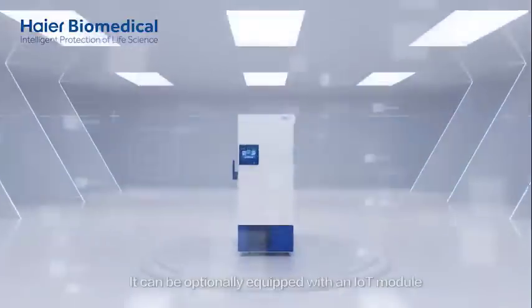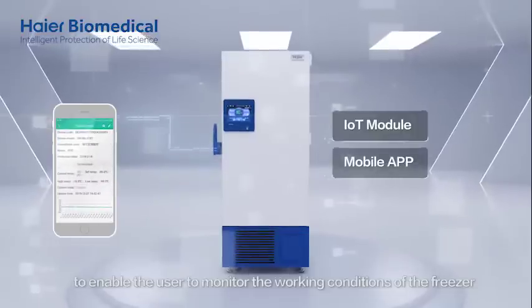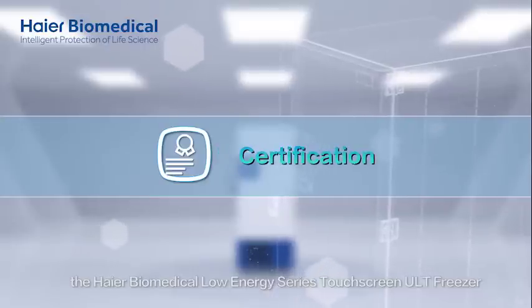It can be optionally equipped with an IoT module to enable users to monitor the working conditions of the freezer in real time via a mobile app. The Haier Biomedical Low Energy Series Touchscreen ULT Freezer is more energy saving and environmentally friendly than its competitors.